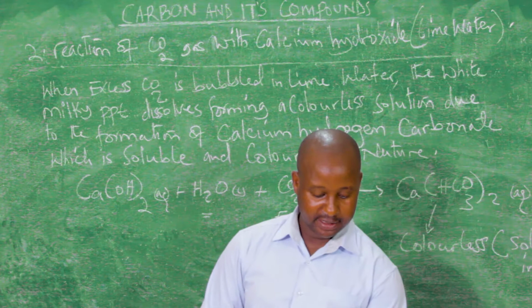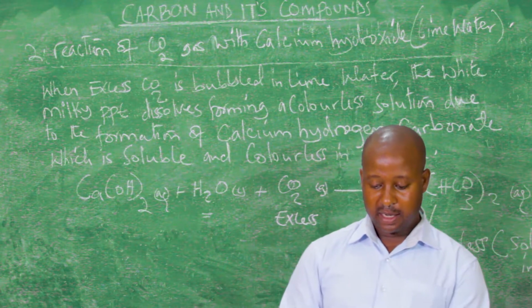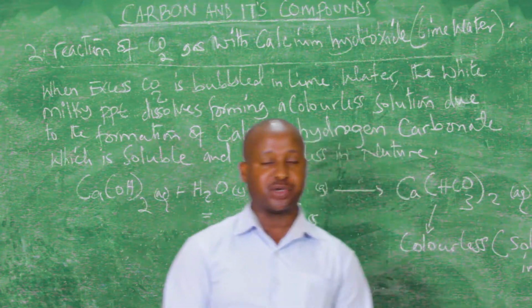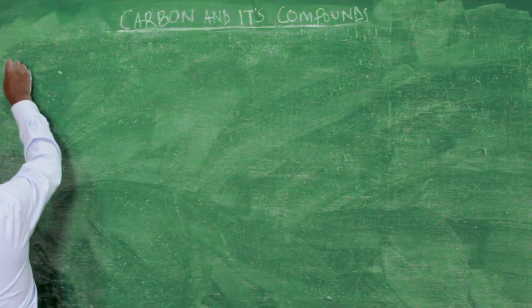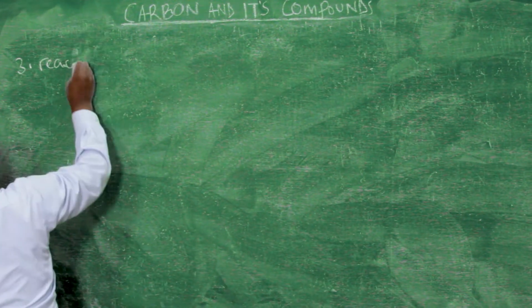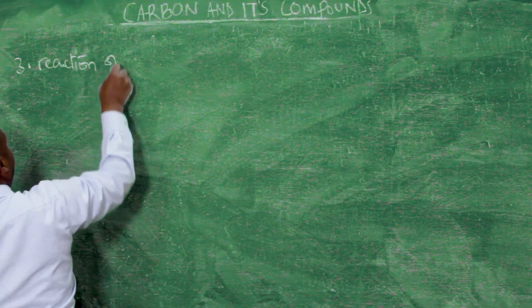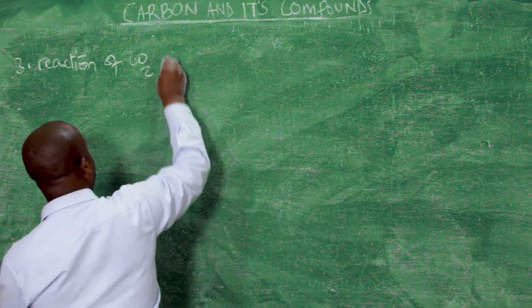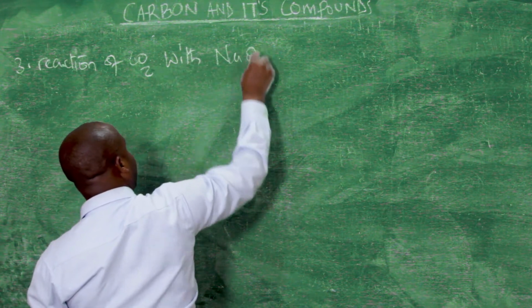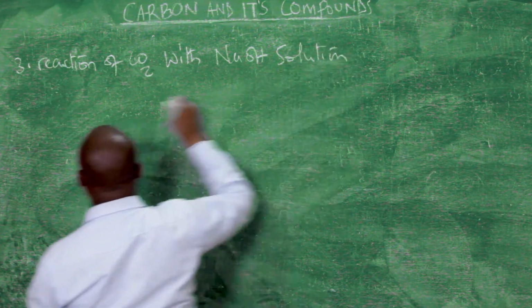Let's look at the reaction of carbon dioxide with sodium hydroxide solution.